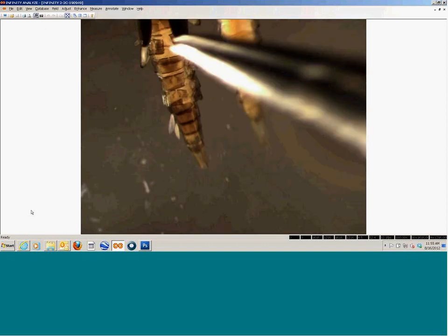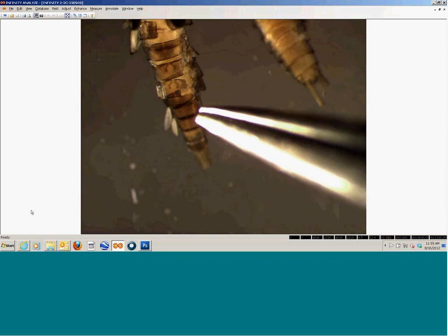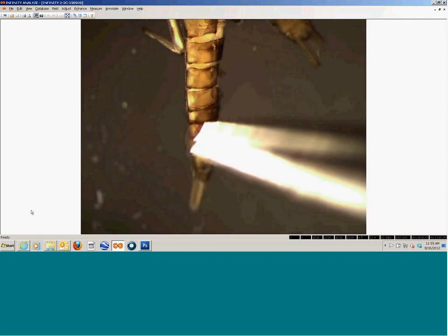And these are the kind of guys that you'll want to take and pull the gills off of. Sorry, folks. I'm working on the scope while I'm doing this. I'm not looking at the screen. So you'll want to pull the gill off of these guys.